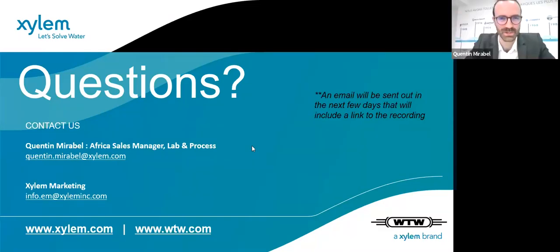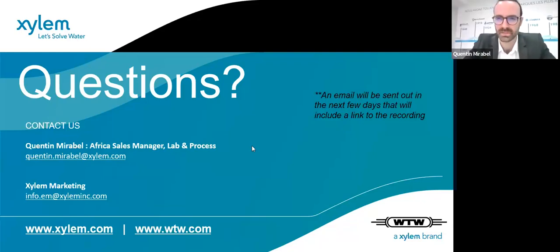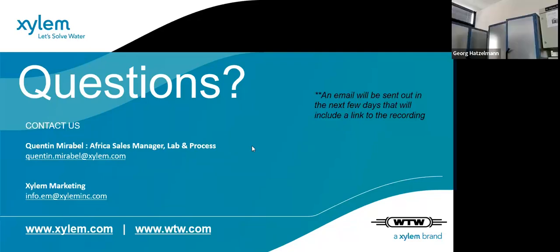Okay, thanks, Georg, for investigating. A question about, again, the display settings. I think we already answered this question, but for the BOD, COD sensor, can we only see COD or BOD? And can we display both from the same sensor? So you can see both. Yeah, it depends on the setting. I changed the setting on my system, so later in the session, maybe we have time to see it shortly.